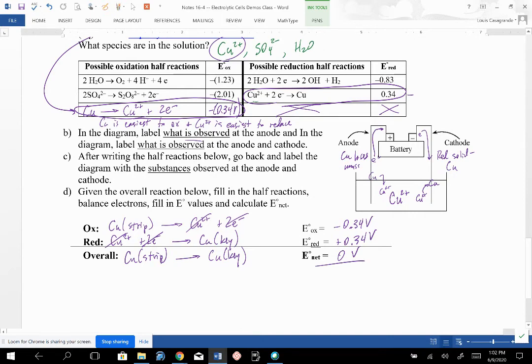So basically the idea of having that copper strip in as the anode is that it replenishes the copper 2+ in solution, so we always keep it at the same concentration. Theoretically, it should never run out. Now, there are going to be impurities that come out, and you're probably going to have to clean the solution. But if this was an ideal case, you would never have to replace anything in the solution. It would just continue as long as you had electrons to pump from your battery.